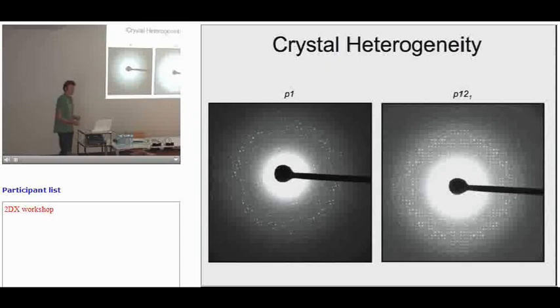which was to collect a diffraction pattern and an image. And this is where having a microscope such as the Polara, which can rapidly switch from imaging to diffraction and back and forth in about 5 or 10 minutes, is quite useful, as I could go through, take a grid square, collect the 15 or 20 diffraction patterns, quickly switch to imaging, collect images of those same regions, and then go on to the next grid square. Whereas with a microscope, it's more difficult to switch back and forth between modes. It would have taken much more time.